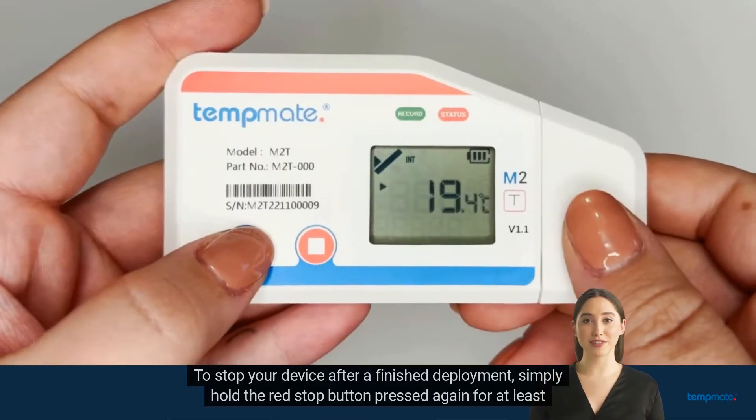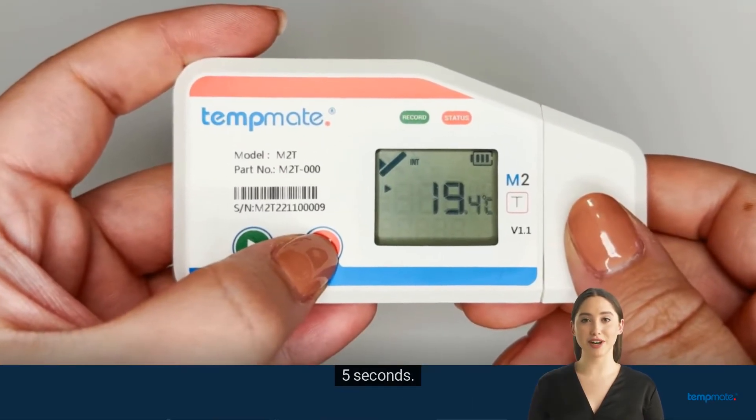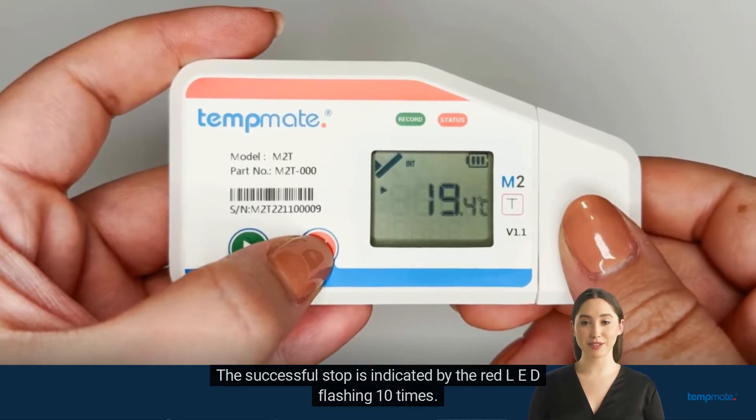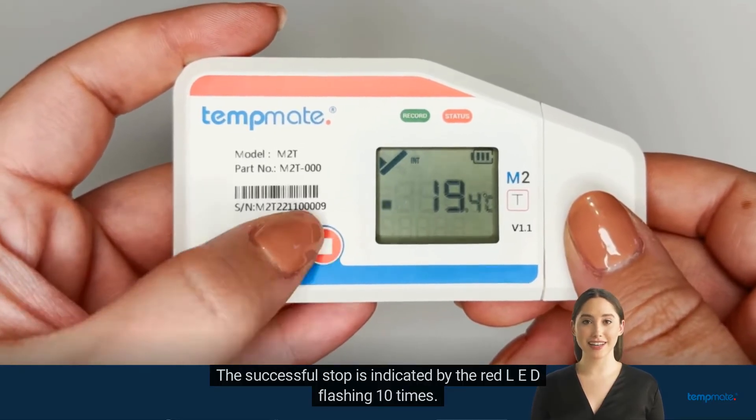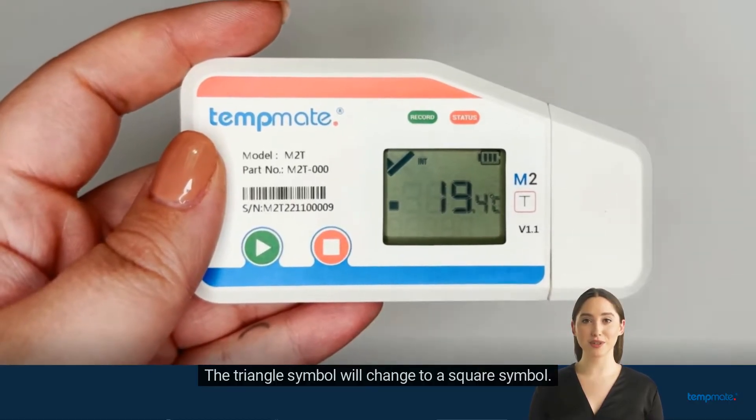To stop your device after a finished deployment, simply hold the red stop button pressed again for at least 5 seconds. The successful stop is indicated by the red LED flashing 10 times. The triangle symbol will change to a square symbol.